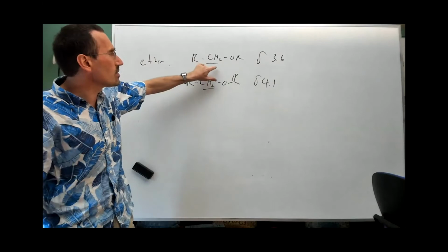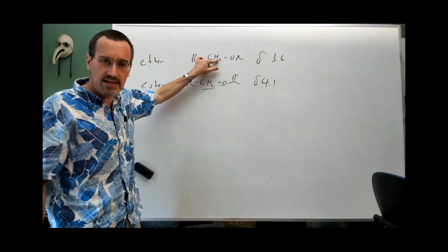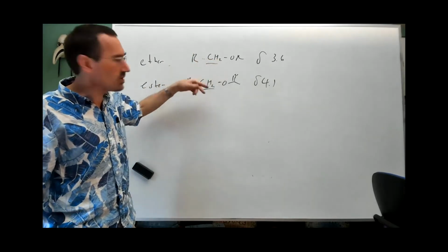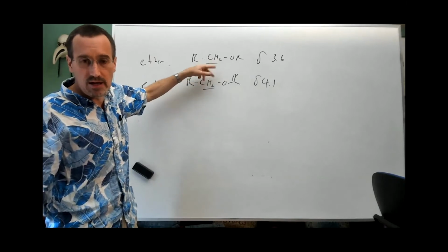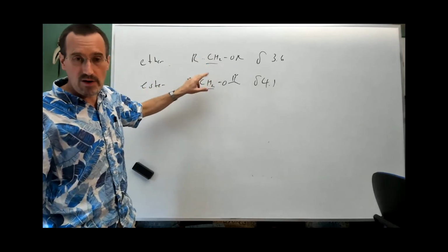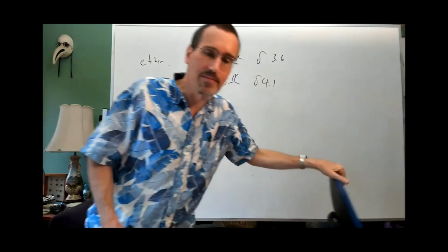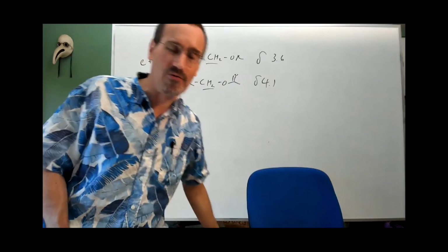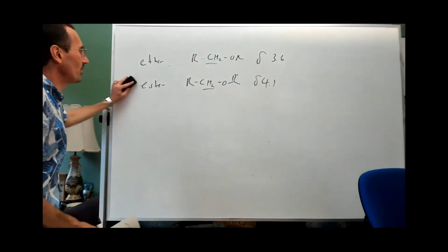I think the other reason why I keep the numbers here for methylenes in my head is they're very common and they sort of stand out, because often you'll see a quartet or a triplet or a doublet for spin-spin coupling, whereas singlets, ironically, are a little easier to miss. So if you get a methyl singlet, it's almost easier to overlook it than it is to overlook a doublet or a triplet.